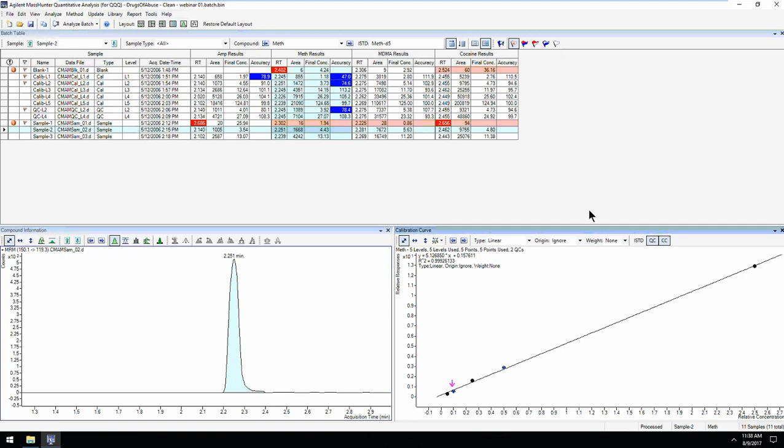Sure. And I do have one more question, and then we'll check the phone lines one last time. Alan, has anybody pressed star 1? No questions over the phone lines. Okay, and the last question before we keep going, although don't worry, for those of you who've asked more questions, we will stop for 3 or 4 more question and answer periods, so don't feel that we're ignoring you.